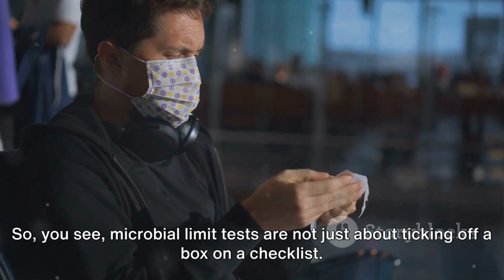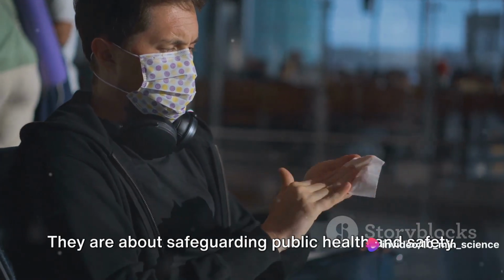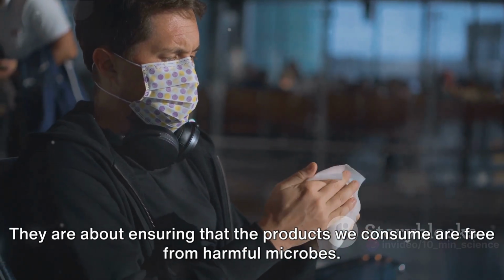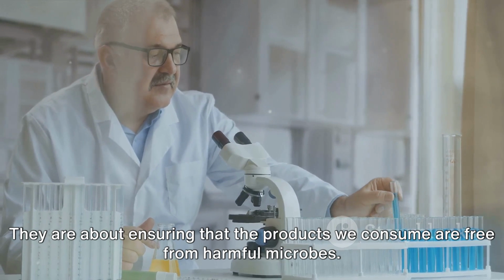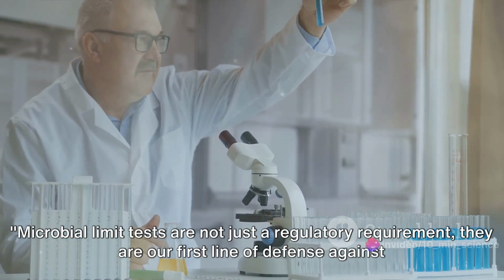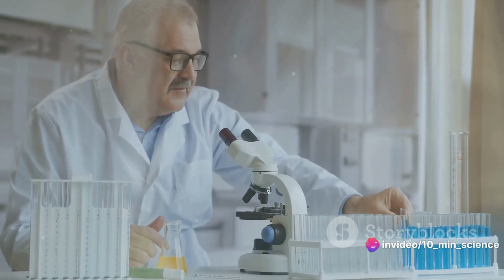So, you see, microbial limit tests are not just about ticking off a box on a checklist. They are about safeguarding public health and safety. They are about ensuring that the products we consume are free from harmful microbes. Microbial limit tests are not just a regulatory requirement. They are our first line of defense against potentially harmful microbes.